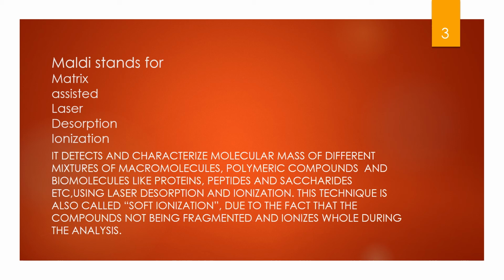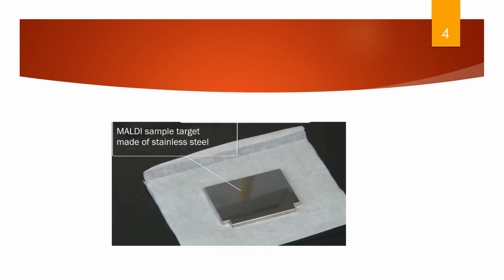It detects and characterizes the molecular mass of different mixtures of macromolecules, polymeric compounds, and biomolecules like proteins, peptides, and saccharides, etc., using laser desorption and ionization. This technique is also called soft ionization because the compounds are not fragmented and are ionized whole during the analysis.